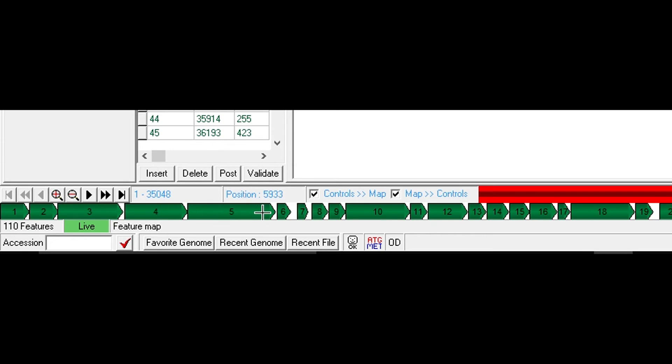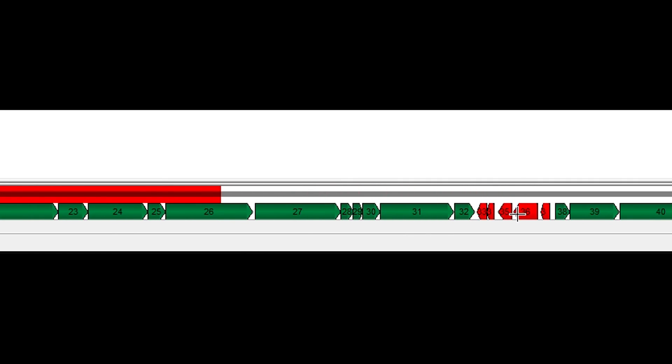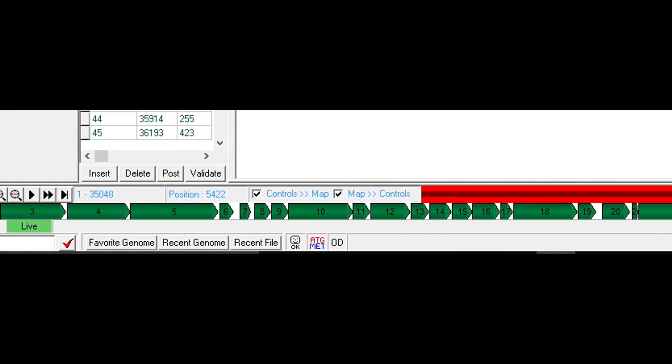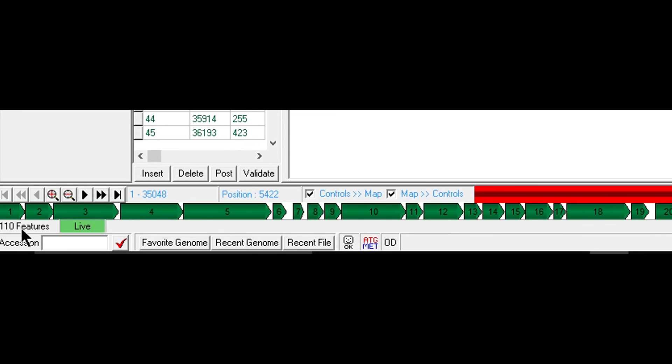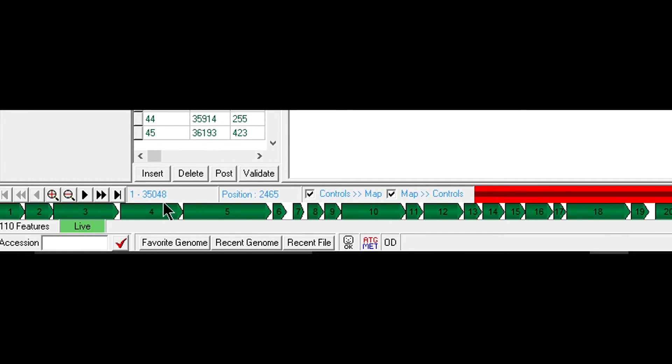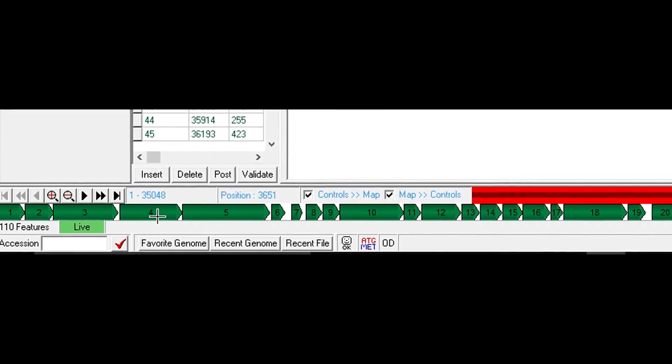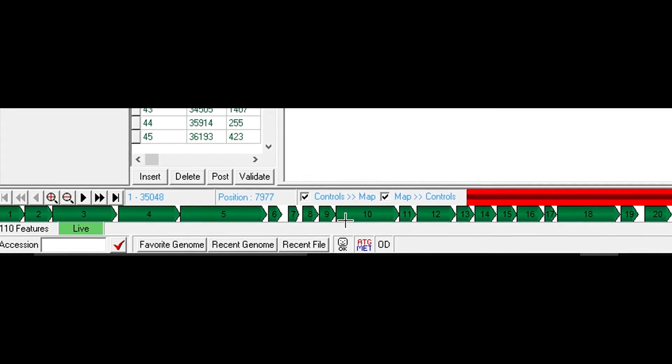The green genes are transcribed from left to right or forward genes, and the reverse genes in red are transcribed from right to left. As you can see we have 110 features or 110 genes that were called on consensus by three different bioinformatic programs and they were placed into our genome. So let's get started with the bottom here.